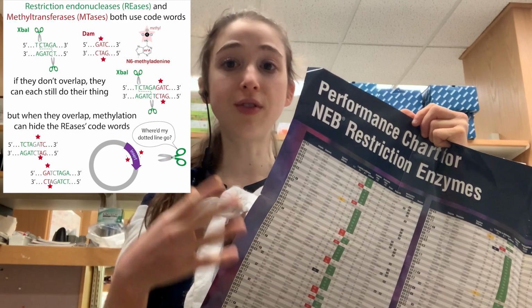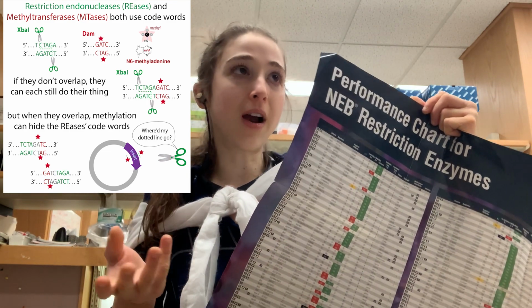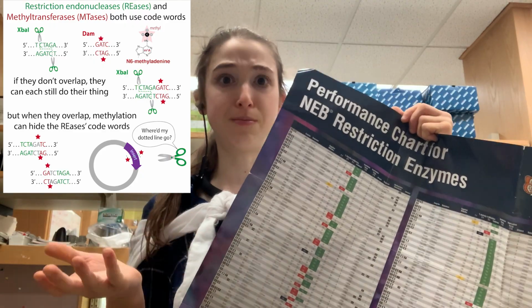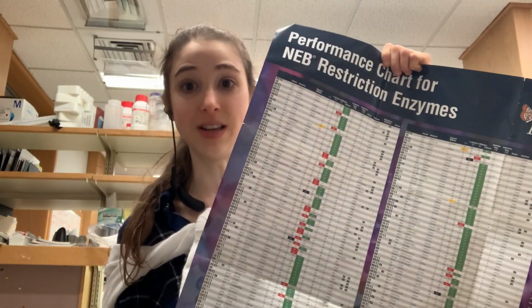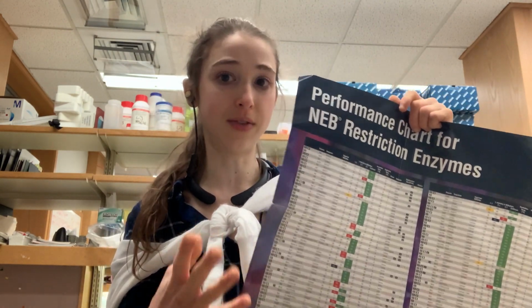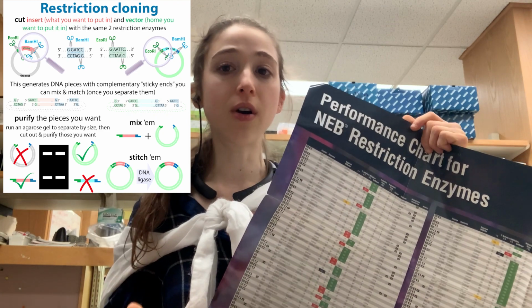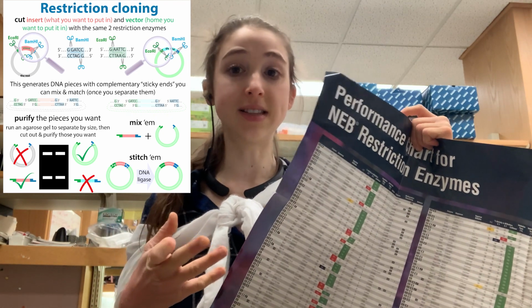So they're able to restrict or limit the activities of these phages, but for us, the use of these enzymes is pretty limitless, which is why there are so many that we can buy commercially. And these all recognize and cut different sequences. And so what do we use them for? All sorts of things. A key use is restriction enzyme cloning.